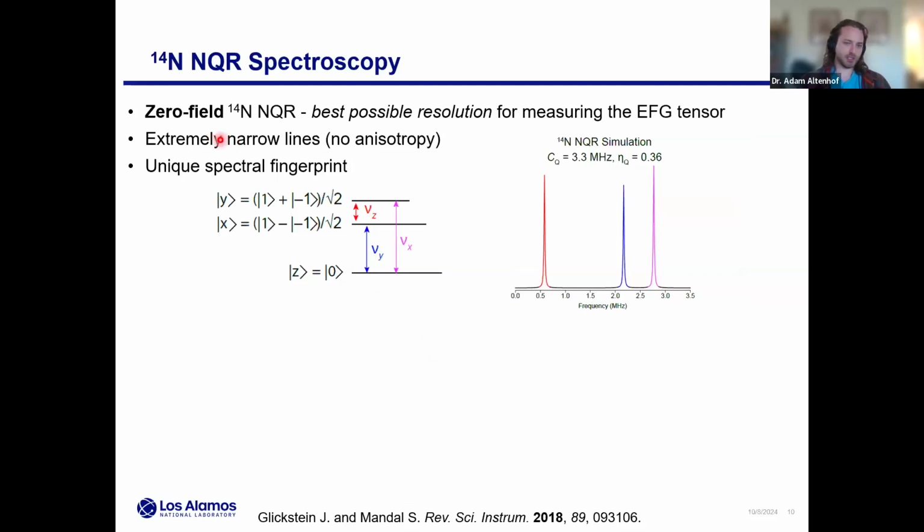So what's really interesting about NQR is that we're getting the best possible resolution for measuring the EFG tensor, which is kind of ironic when talking about these high fields. Part of the reason for this, right? There's no orientation of crystallites to the magnetic field because there is no magnetic field. So now you're just left with these narrow lines. In the case of 14N, it's a spin 1 nucleus, so we have these 3 energy levels. We actually observe 3 transition frequencies, highest to lowest. So if I simulate some, say, average 14N tensor parameters with the quadrupolar coupling and this asymmetry parameter, I'm going to see 3 of these lines for a single site.